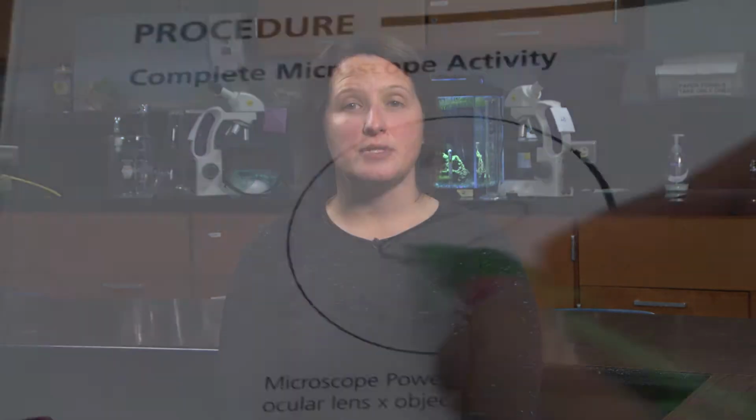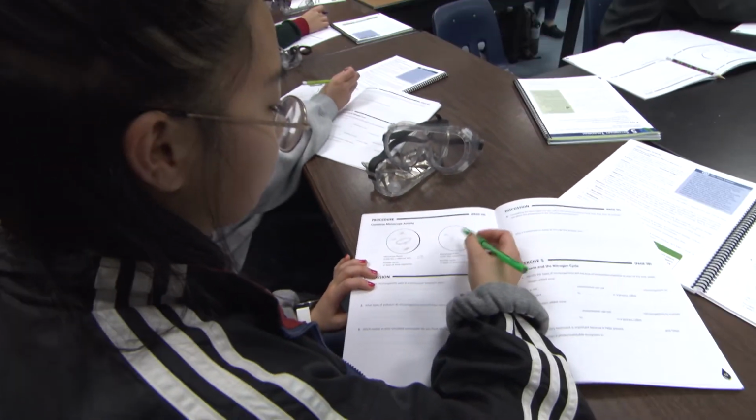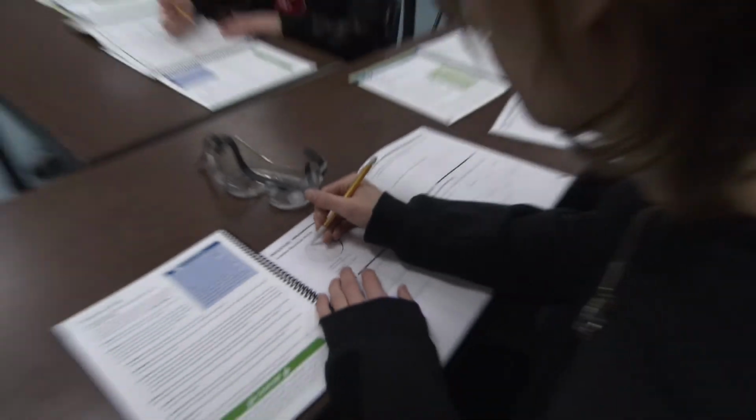Once they have identified a couple of different microorganisms, they can remove and throw away their gloves and wash their hands. The students can now draw their microorganisms either from memory or from the poster and answer the questions in the workbook.